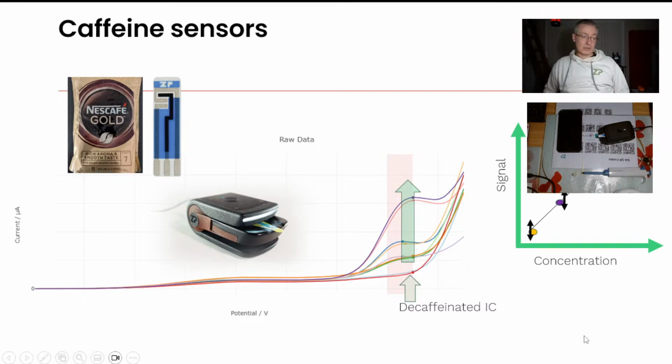Now, if people are using our screen-printed electrodes and our electronics, then I will take some responsibility for the reproducibility. Of course, once people start functionalizing the surface, start drop casting and doing that kind of stuff, then they're bringing a process into that sensor that is outside of our control, at which point you have to take responsibility for reproducibility after that.